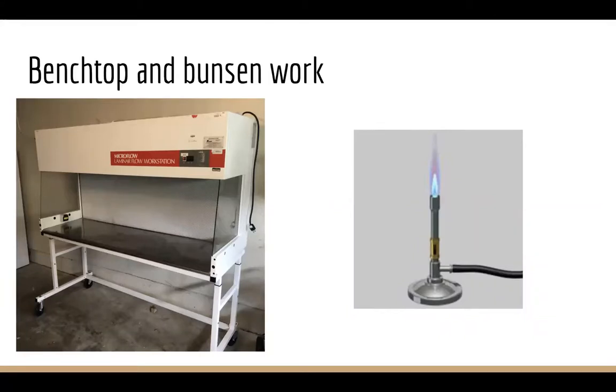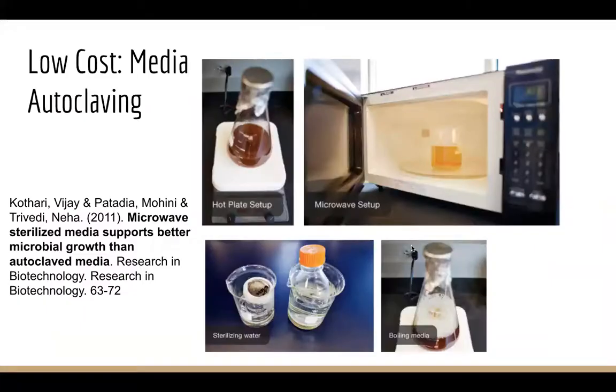So I would recommend getting them secondhand, because in the end, all they are is a filter and some air that is being pushed upwards off your plates, pulling it through. So effectively, it doesn't go onto your agar. So it's not that complicated, and I would recommend probably getting it secondhand. Just wipe it up afterwards to make sure you don't get contamination.